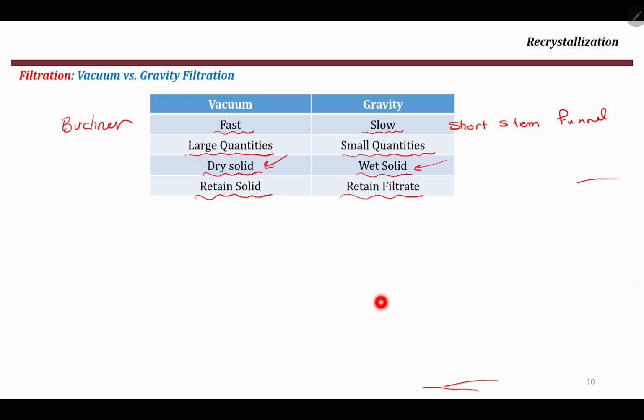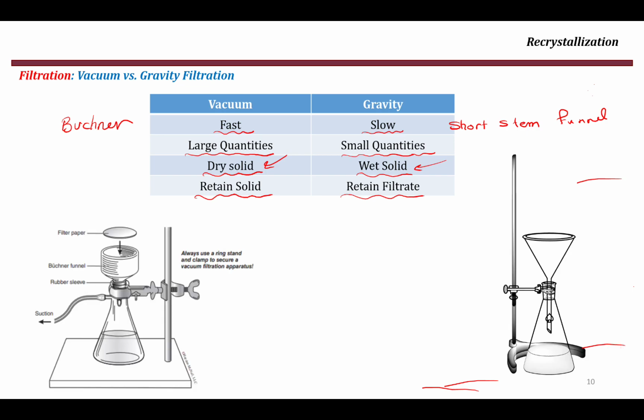And this is a scheme which shows us the difference between the two: this is the gravity filtration setup, and this is the suction filtration or vacuum filtration setup.